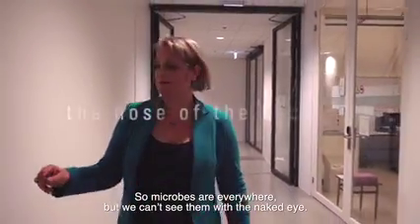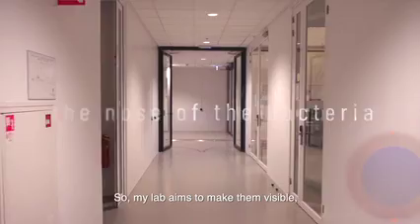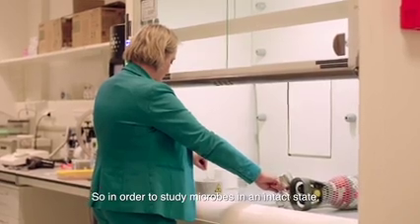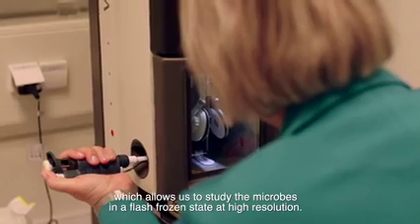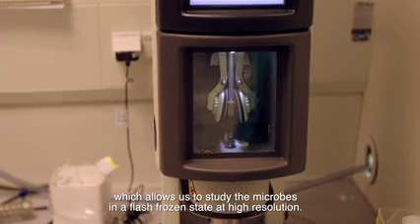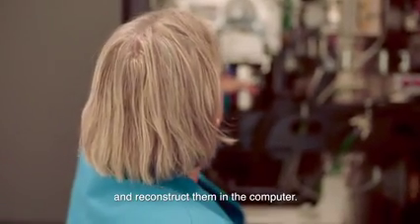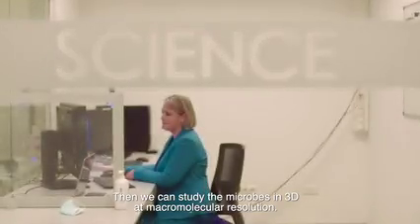So microbes are everywhere, but we can't see them with the naked eye. So my lab aims to make them visible, to really study them at the molecular detail. In order to study microbes in an intact state, we use a method called cryo-EM, which allows us to study the microbes in a flash-frozen state at high resolution. Once the cells are frozen, we can take images from all different angles and reconstruct them in the computer. And then we can study the microbes in 3D at macromolecular resolution.